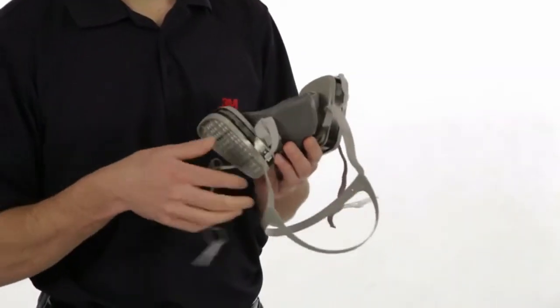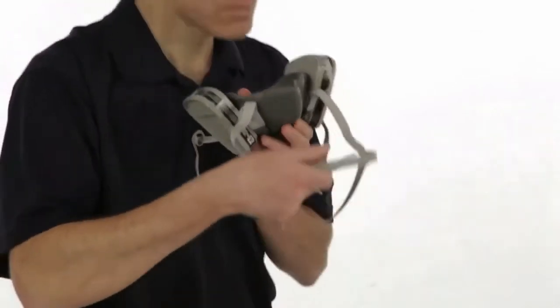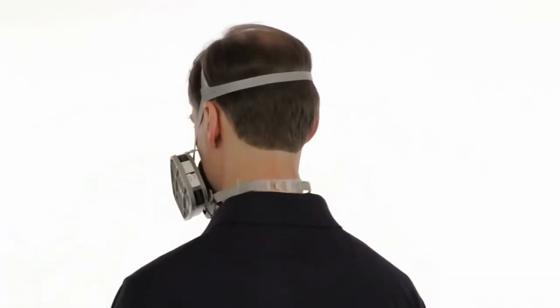Donning 6000. Before you put on your respirator, make sure the straps are pulled far enough through the buckles to permit easy adjustment. Place the respirator over your mouth and nose. Then pull the head harness over the crown of your head. Position the facepiece low on the bridge of your nose for the best possible fit and to prevent the respirator from blocking your vision. Take the bottom straps in both hands and hook them together behind your neck.